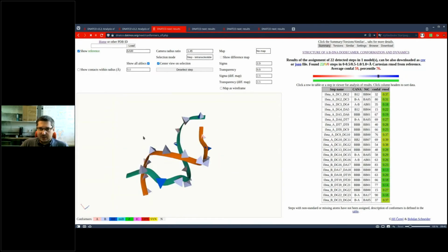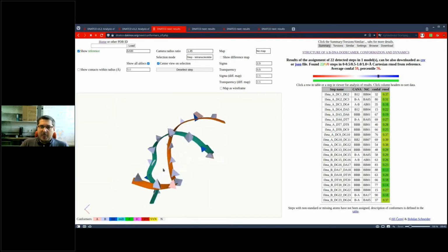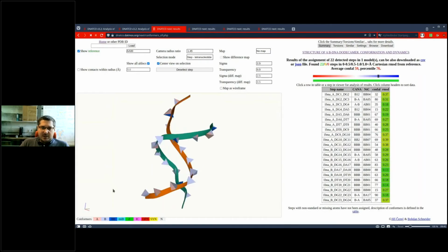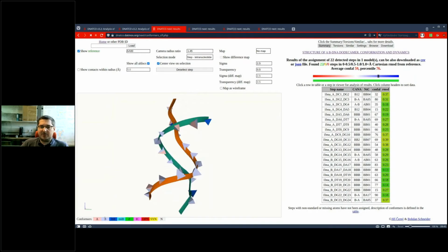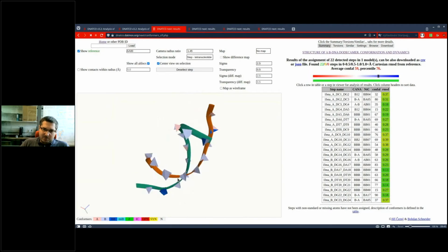So on the bottom left, you can see the structure, and the conformations of the steps are color coded and plotted as these colored pyramids. Obviously there is a key for these colors, so you can immediately see that because it's mostly blue, it's mostly B conformation of the DNA, but it's not completely blue.